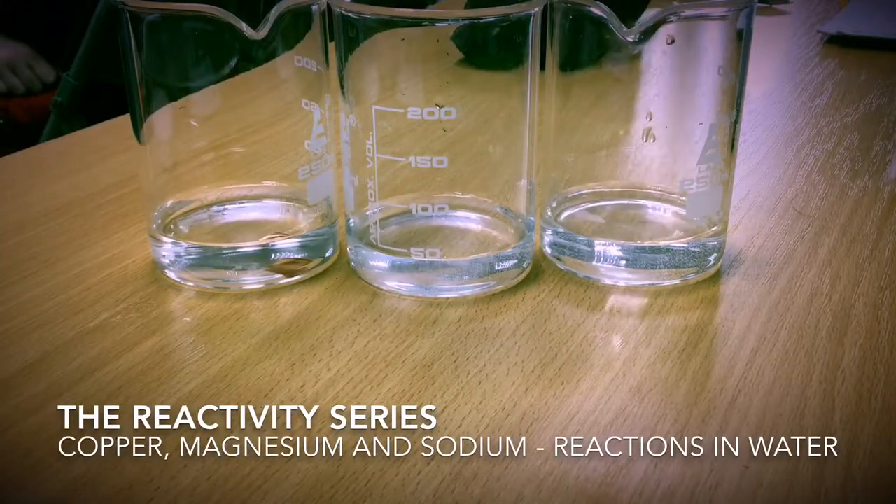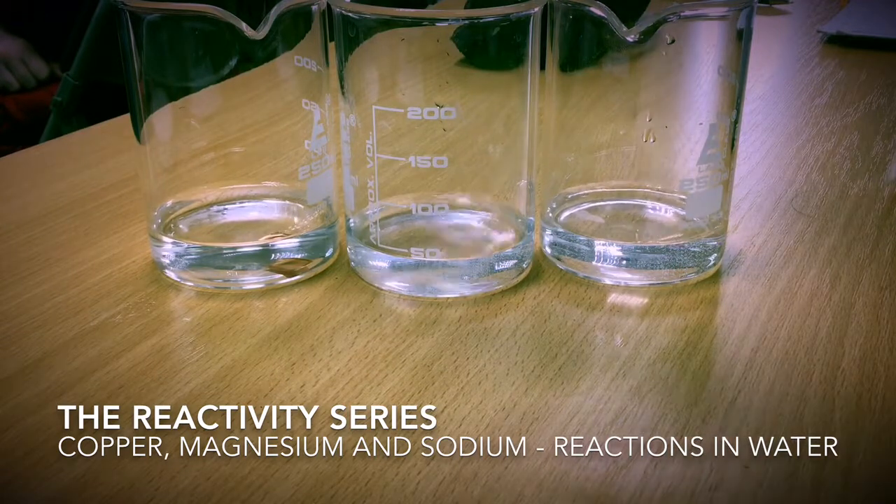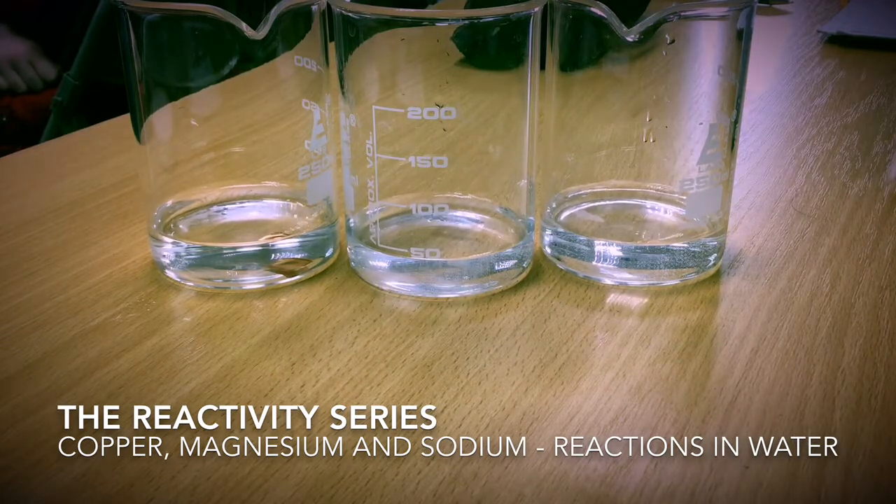In this experiment we will explore the reactivity series. We have three different metals: copper, magnesium, and sodium. Each of these metals has different properties and reacts differently with water and acid.